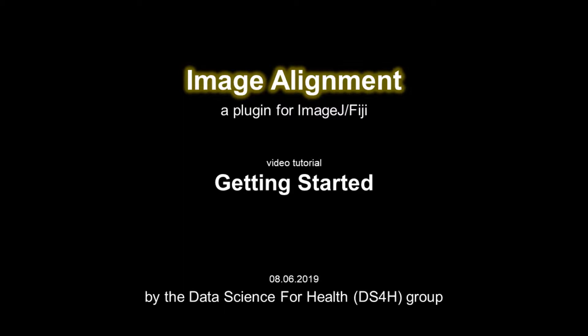I will show you how the Image Alignment plugin works and what its basic features are.